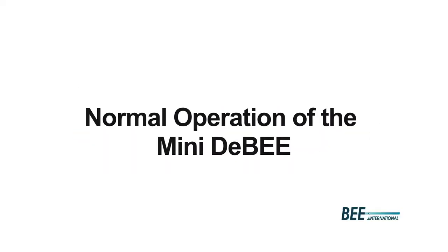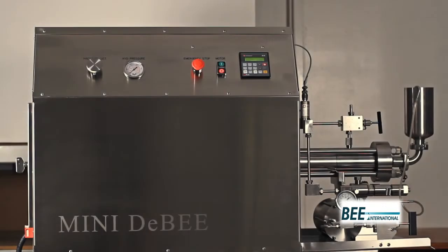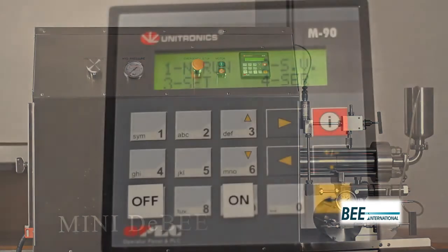Let's take a look at the Mini2B components. On the control panel we have the pressure set dial to control the process pressure, the hydraulic pressure gauge, the emergency stop button, the motor on and off button, and the PLC where operational controls are located.